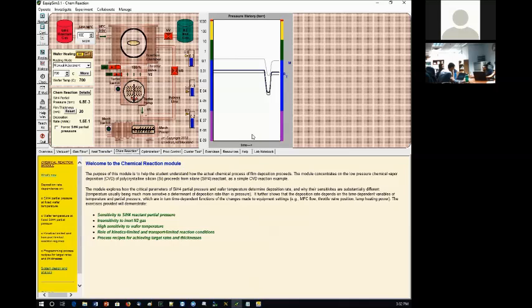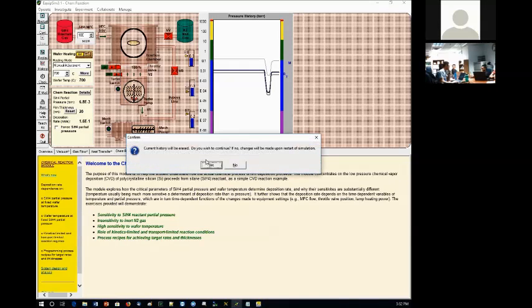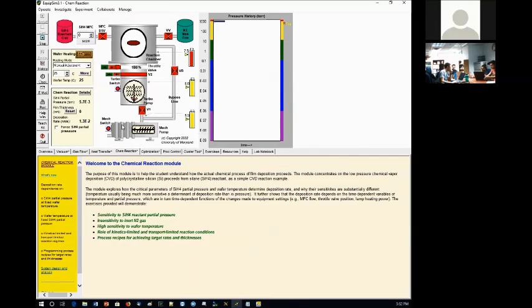All right. Now, coming back to this simulation program, I'm going to turn on the whole thing one more time. Mechanical switch, turbo pump. Everything is turned on. Great. So now everything is set to 600 degrees. I can turn that on as well. So temperature 600 degrees. Mechanical pump is turned on. This valve is turned on. Turbo is turned on. I will scan for the pressure change.